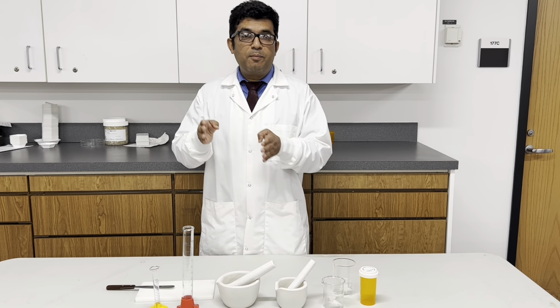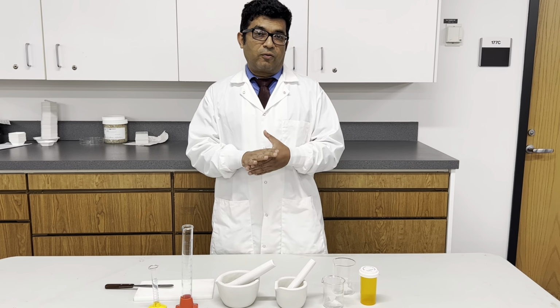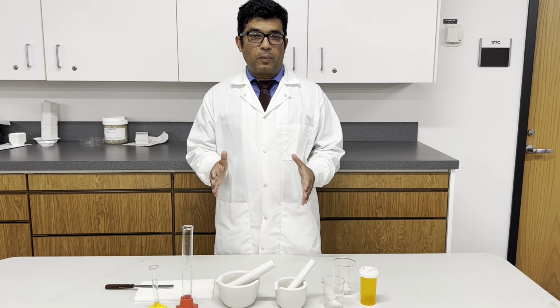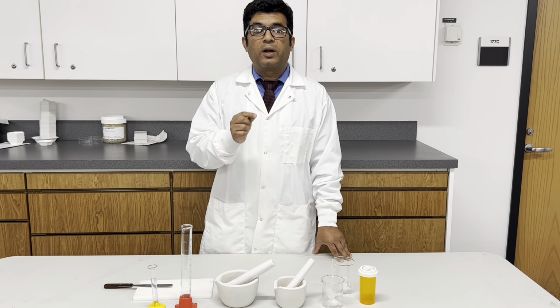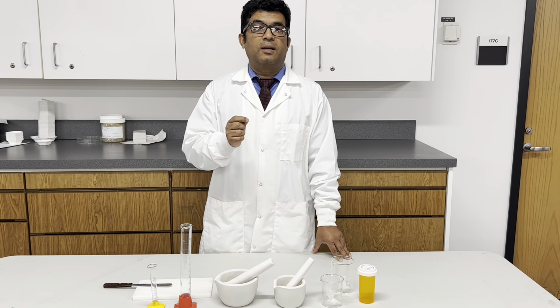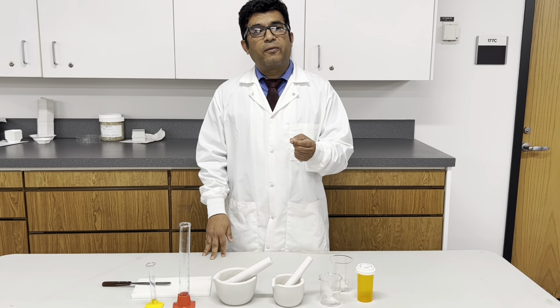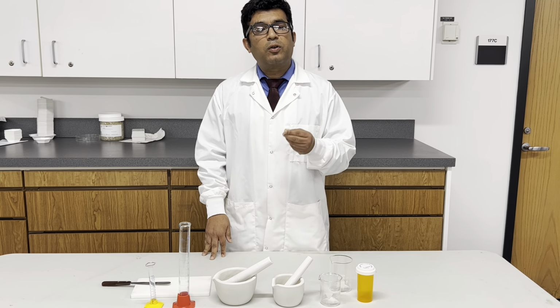This happens the same with the torsion balance or prescription balance and also the electronic balance. For the torsion balance or the prescription balance, the minimum weighable quantity is 120 milligrams. That means less than that you cannot weigh. But say your prescription says you have to weigh 5 milligrams. So how are you going to do that?